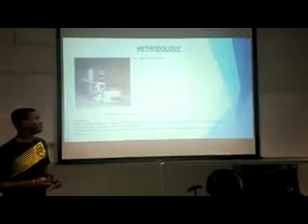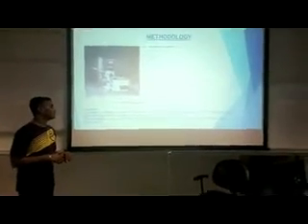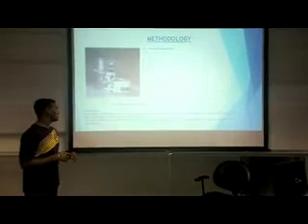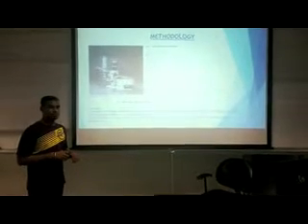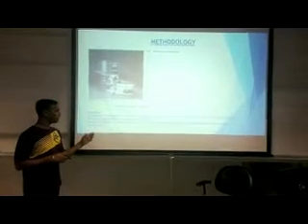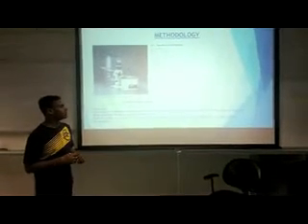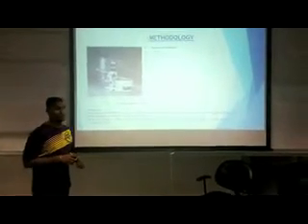Before we start the experiment, we have to calibrate the samples. First of all, samples of different volumes of sodium hydroxide are prepared and labeled. Then the refractive index of each mixture is measured. Later, refractive index, also known as RI, versus composition for all the mixtures is plotted, as this will be the calibration curve for further experiments.